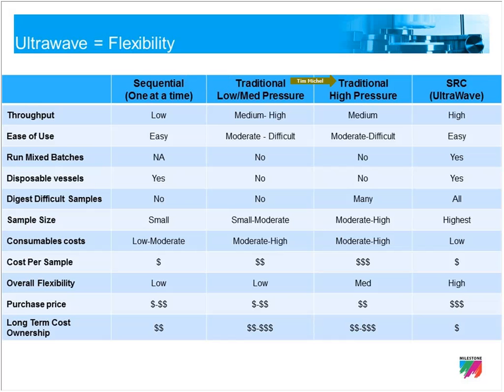Traditional high pressure systems, as we move right here, the flexibility of the systems increases. But unfortunately, the one bad thing with the traditional high pressure system is that the sample handling, the vessel handling, gets a little bit more complex, and your throughput definitely goes down.